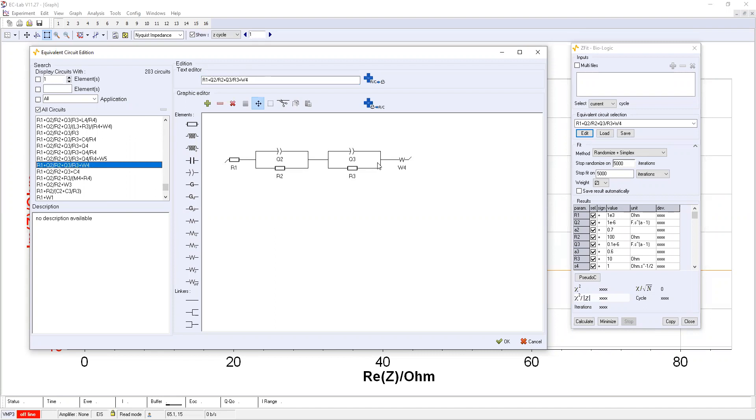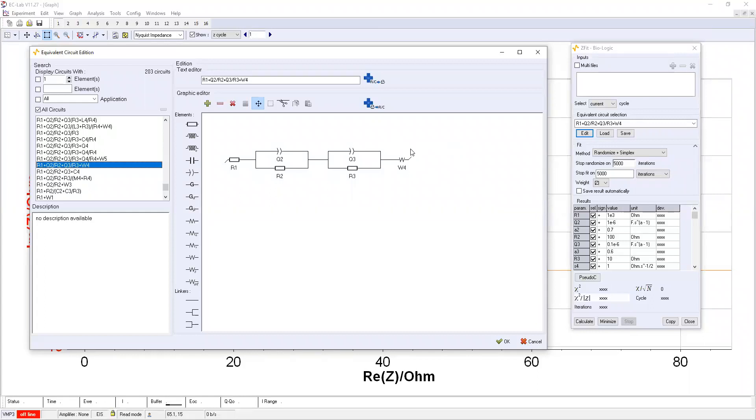But if you want to think that this is not correct, you can actually draw by yourself. I'm going to show how you can draw it. There are some elements like this is resistance, capacitance, constant phase element, Warburg diffusion and other values. And there is a linker you need to link to draw the circuit. Let's say I don't want Warburg diffusion here first. So you can just cut it.